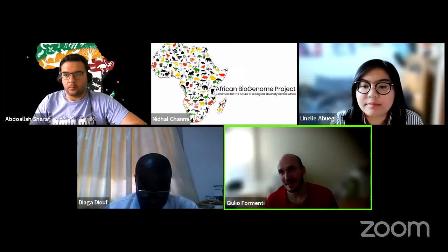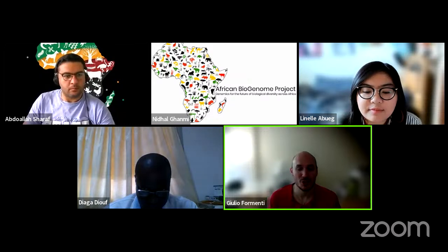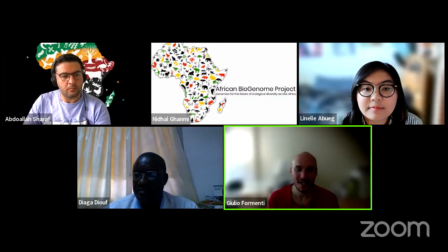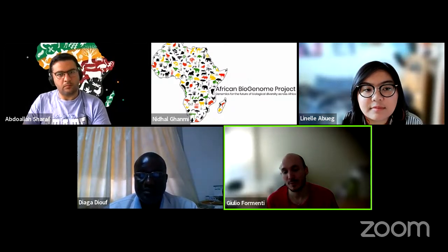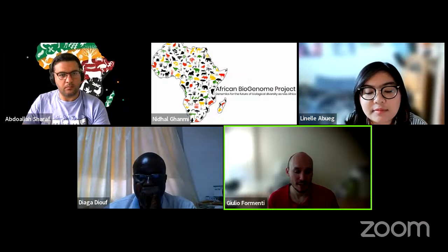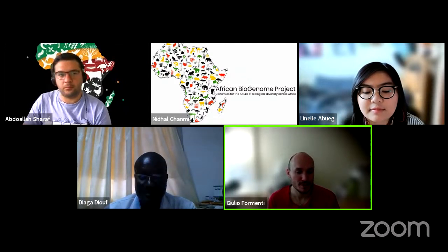The problem, the additional layer of complexity here, is that we should also re-engineer our pipeline to use the Merqury version that uses FastK. So basically, that's something we have started, but not yet done. And again, at this point, it would be a factor of efficiency, which of course makes sense to take into account in an infrastructure like Galaxy, where you depend on the compute sometimes.